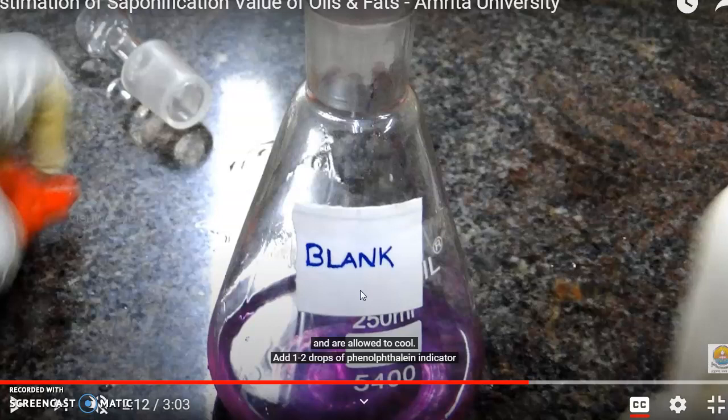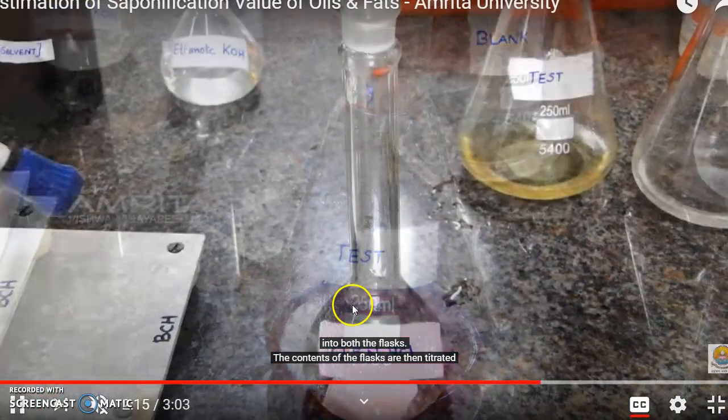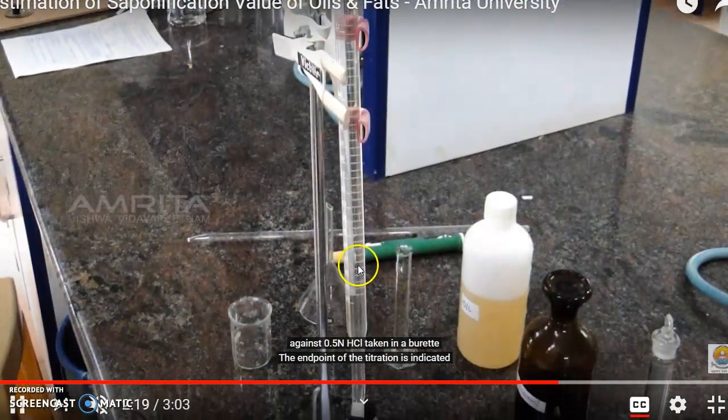After cooling, you can add the phenolphthalein indicator. After adding the phenolphthalein indicator, it looks like a pinkish solution. Now this solution you can titrate with the 0.5 normal HCl.